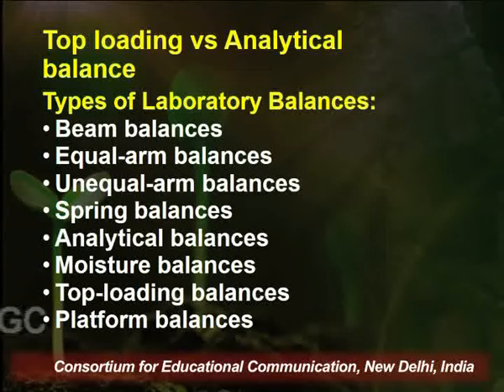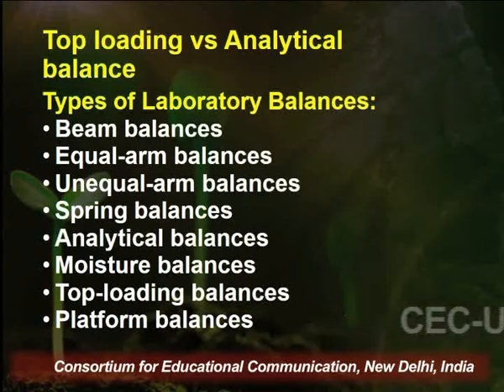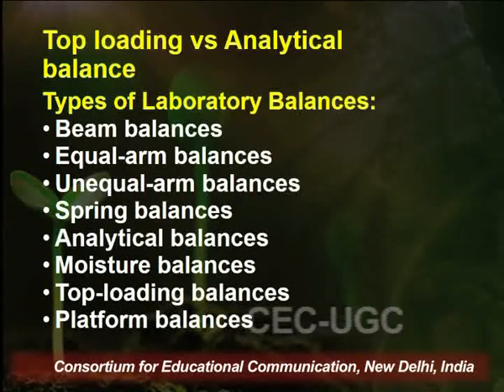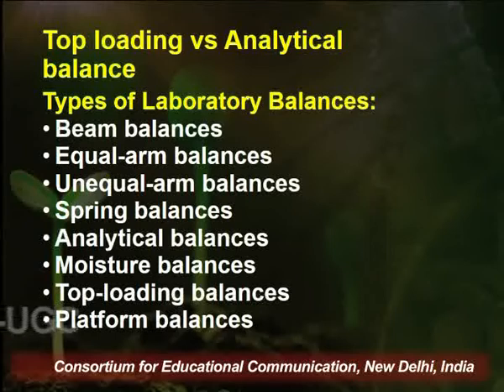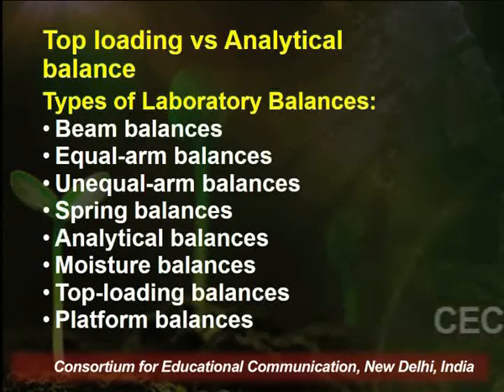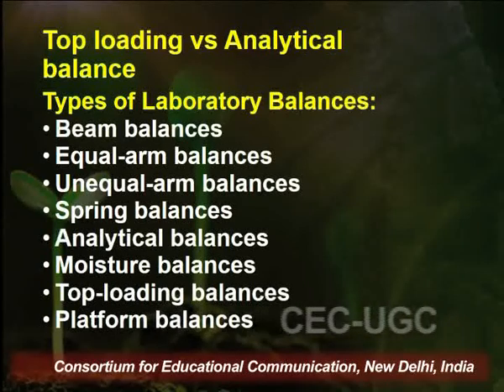There are different types of laboratory balances which one can use in any lab or experiment, such as beam balances, equal arm balances, unequal arm balances, spring balances, analytical balances, moisture balances, top loading balances and platform balances. Out of these different types, today we shall be discussing analytical balances and how they function, and also top loading balances.